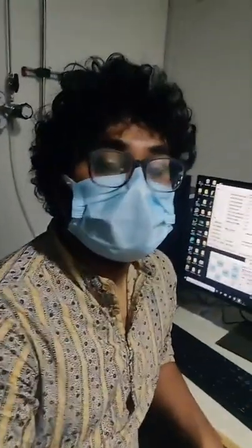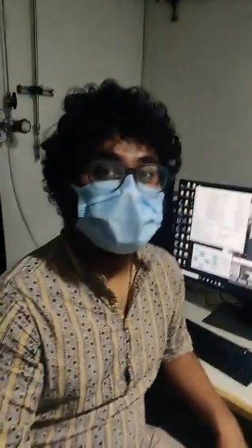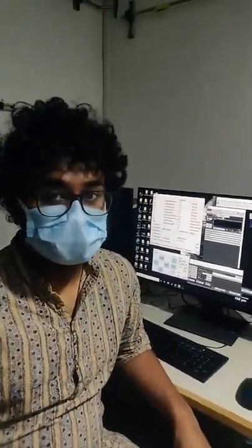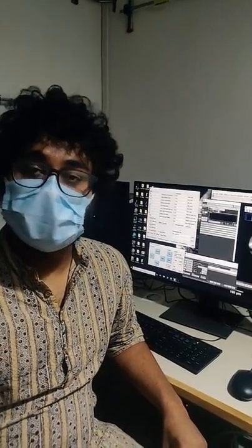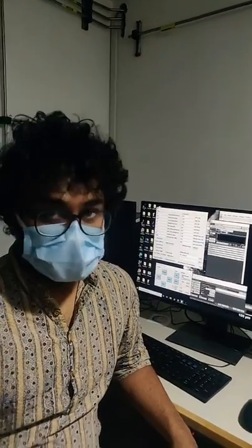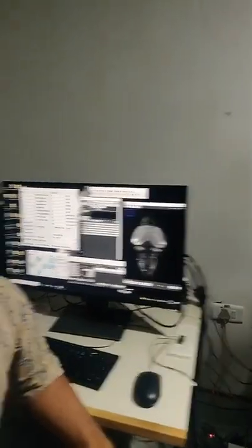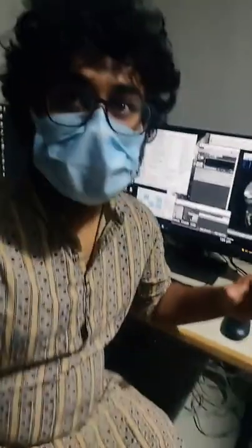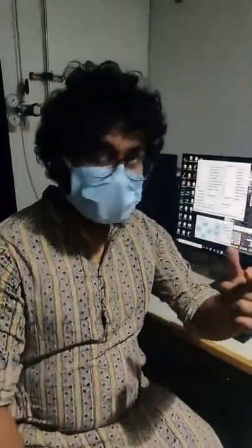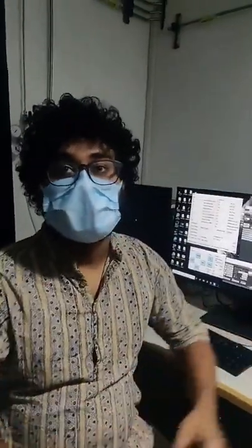So a lot of the fish's body has the brain, right? So most of the body is the brain, is it? What do you mean? Like most of the proportion of the body is the brain? So this fish is 6 days old. Okay. So it will be around 3 or 4 millimeters long. And if you think about it, 1 mm of that is taken up by the brain. Oh, okay. Nice.